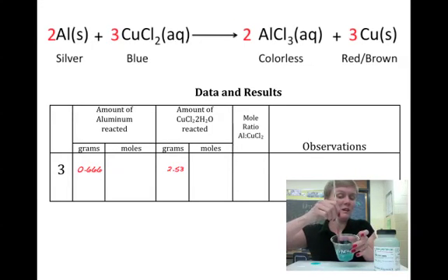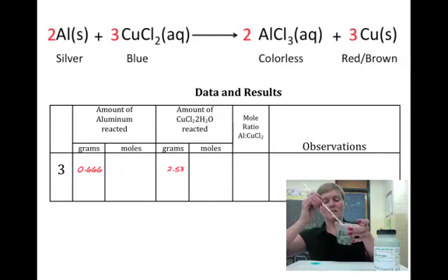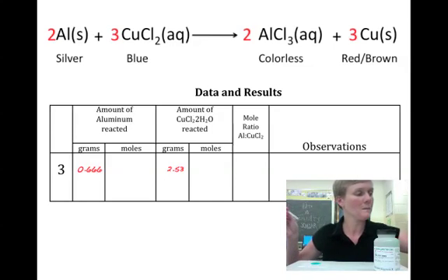Okay, same thing's happening. Sizzle, bubbles. It's starting to form copper solid. Keep stirring. Can you predict what's going to happen? You notice the color is changing. The solution is losing its blue color. Lots and lots of copper is forming at the surface. It's getting very, very hot. Okay, so exothermic reaction, we already talked about those terms. So I'm going to stir, and let's see. After this gets done, here's what it looks like.